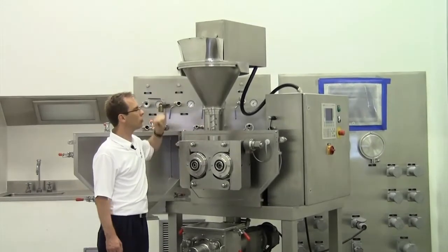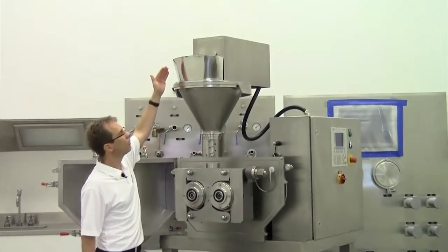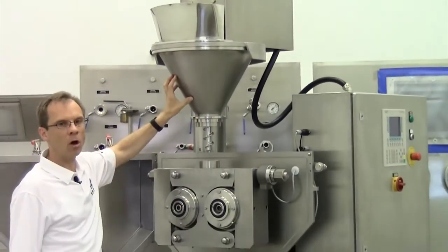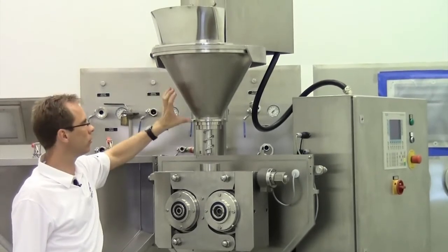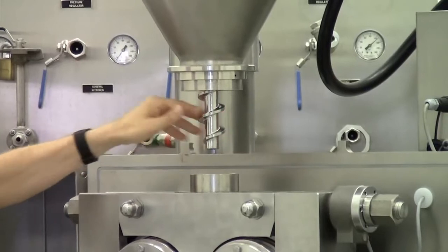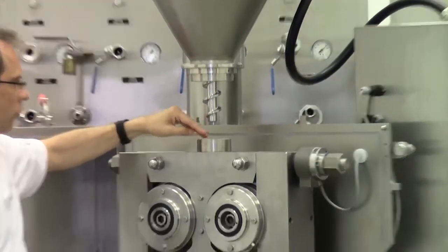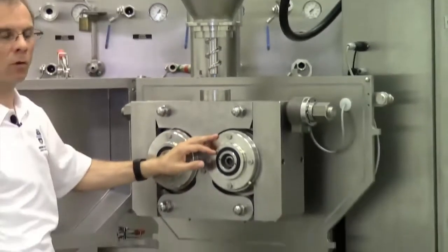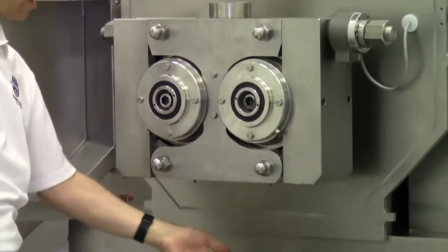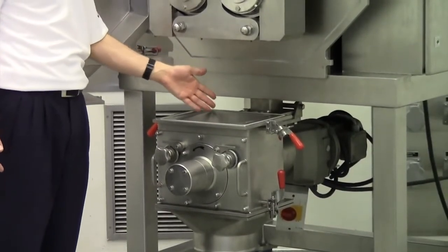I'd like to show you the Pharma Pactor and its interiors. Starting at the top with the infeed chute — it's a manual infeed chute with a conical hopper where you fill the powder. Here we have the screw auger with the stirrer inside, the screw chamber, both rollers for compaction, scrapers underneath the rolls, and the flake crusher for crushing down the flakes to granules.